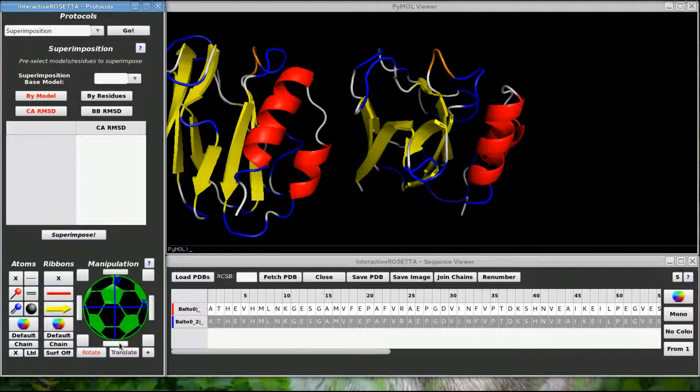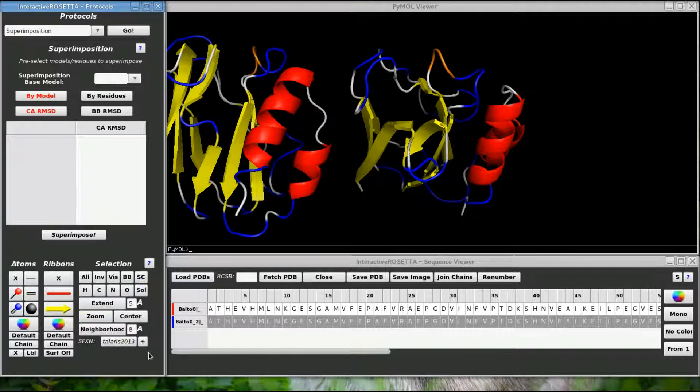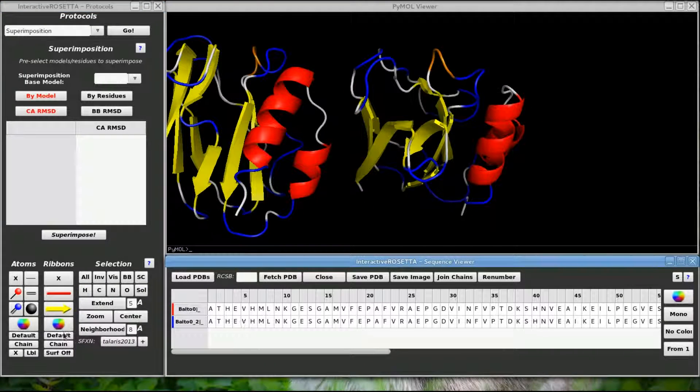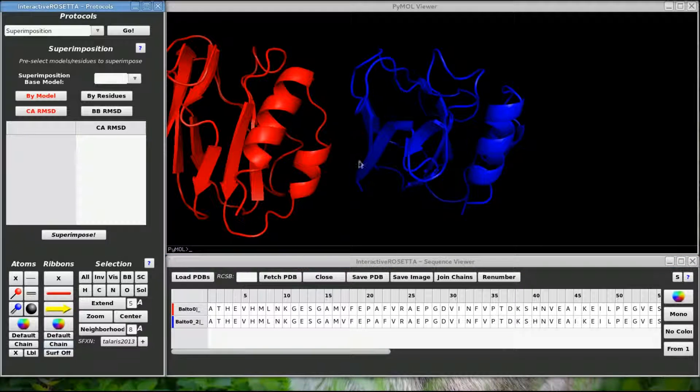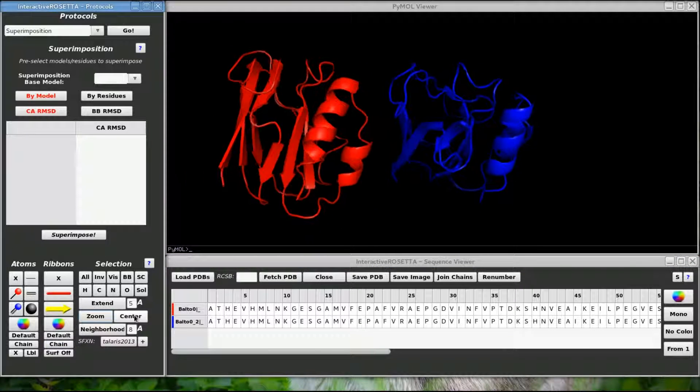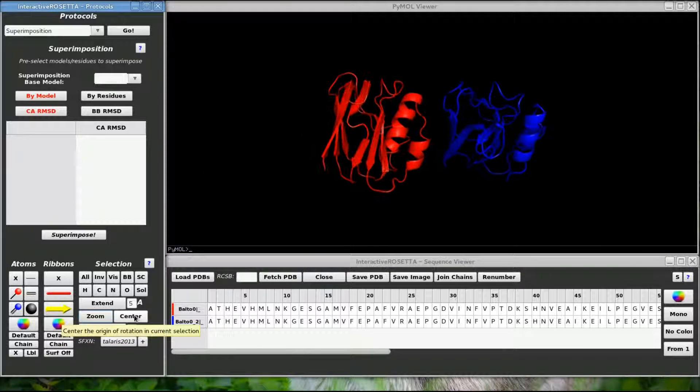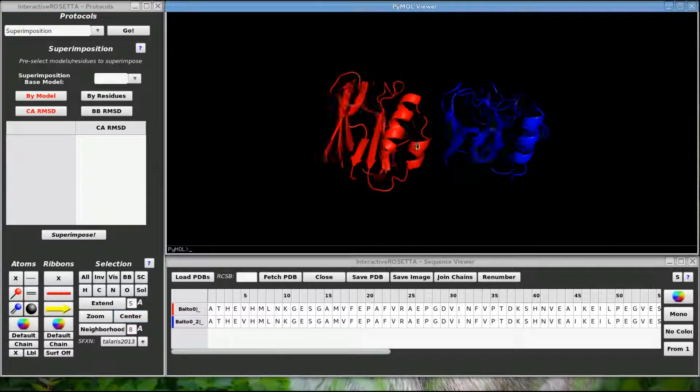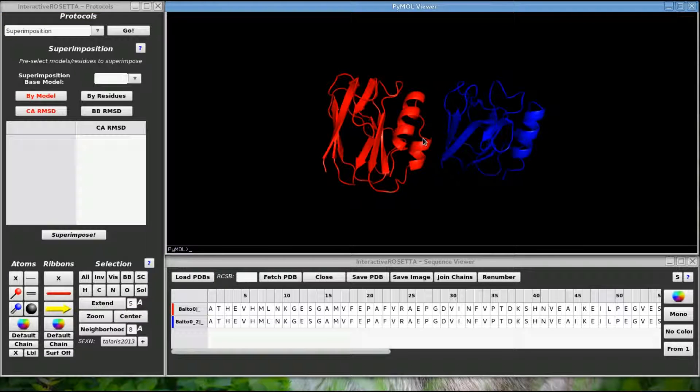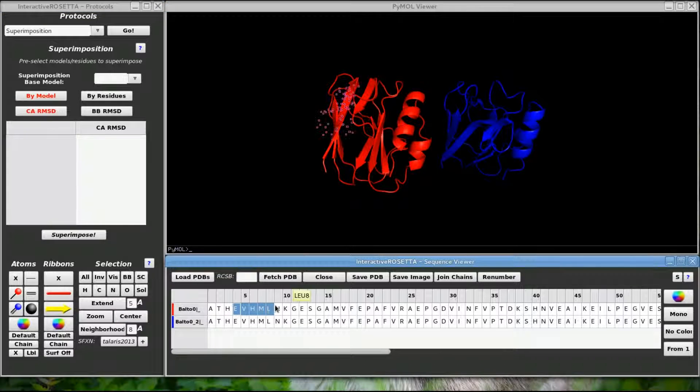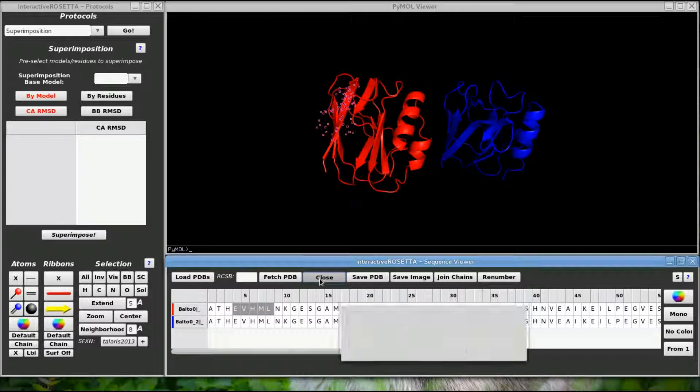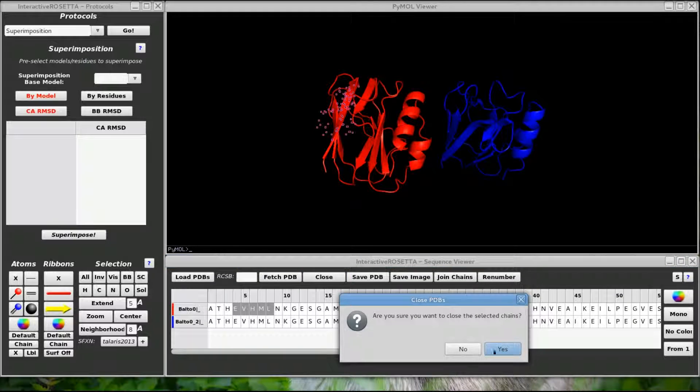Now I can show you the chain coloring. If I color the ribbons by chain, you can see that I have a red structure and a blue one. Now there are some more things you can do in the sequence viewer. Let's delete that first chain by selecting part of it and clicking the close button.